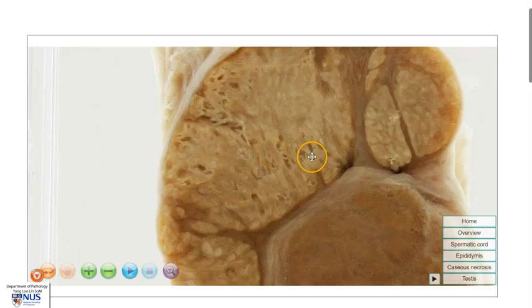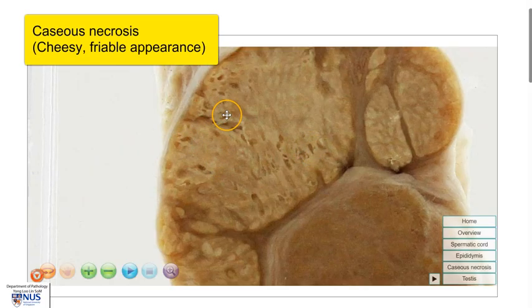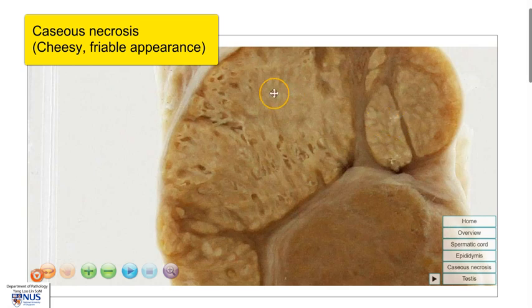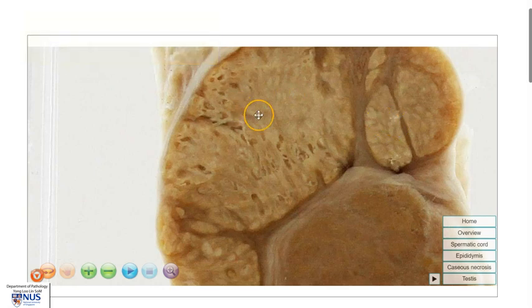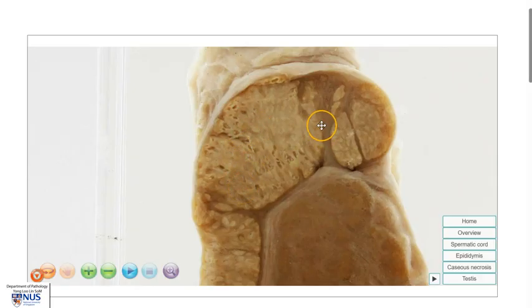This often shows a cheesy, friable appearance where things appear to be falling out, and this is termed caseous necrosis. Caseous means cheesy. So we can see this kind of cheesy, friable, broken up appearance grossly, and this translates to necrotizing granulomatous inflammation and is often seen in mycobacterial infection.